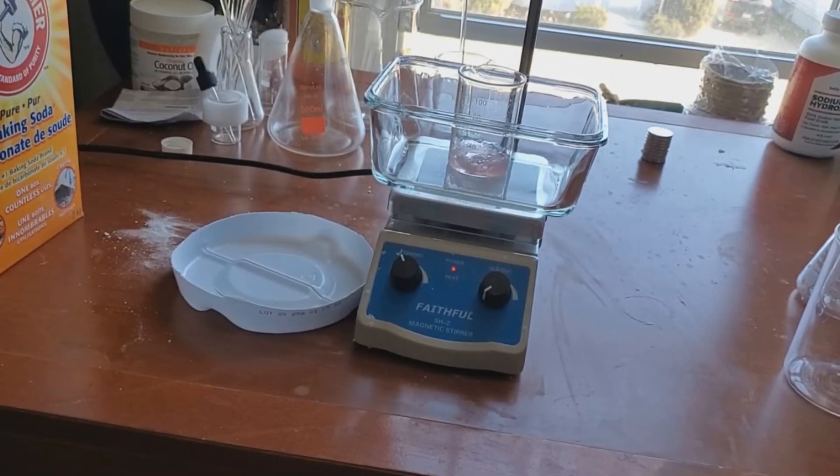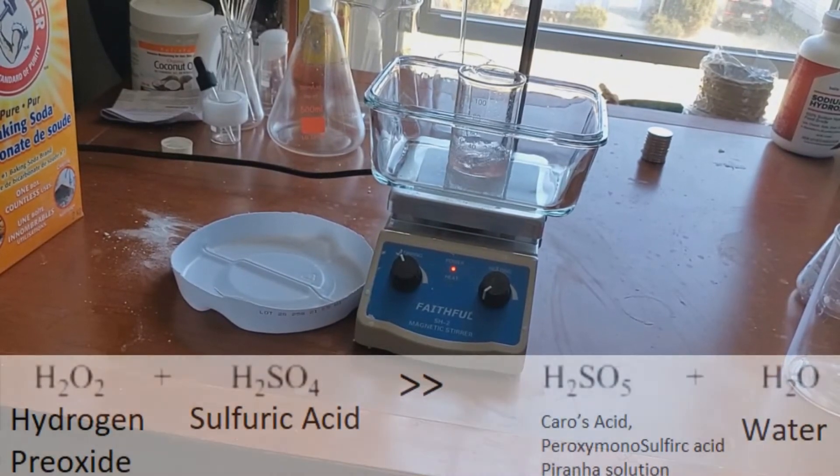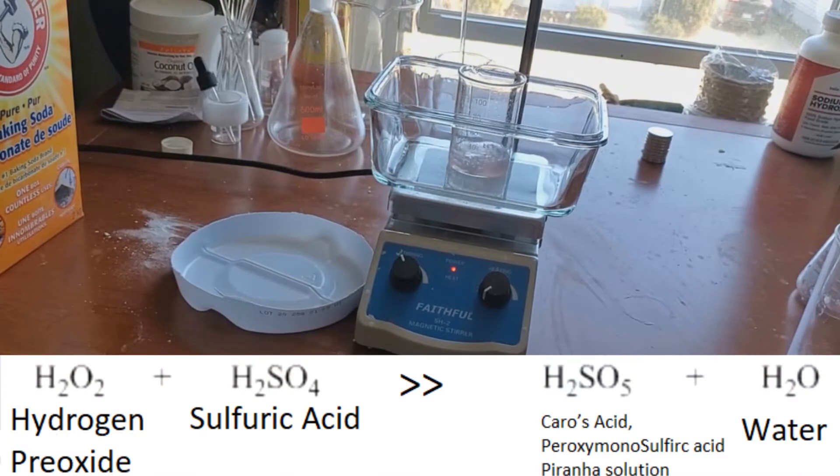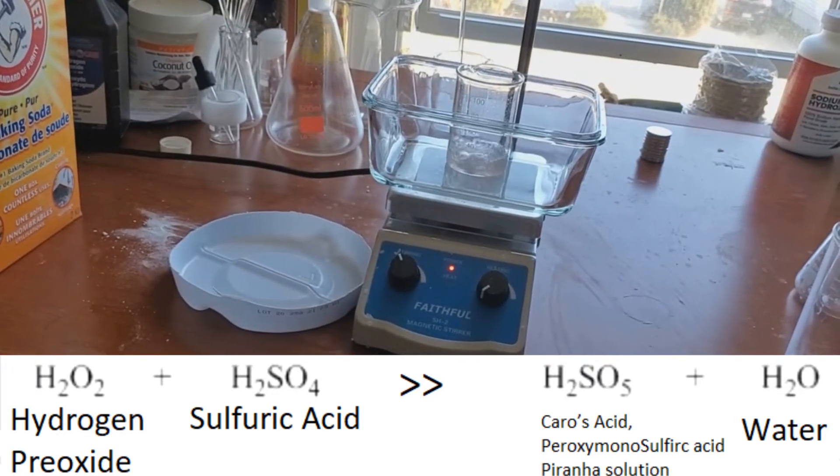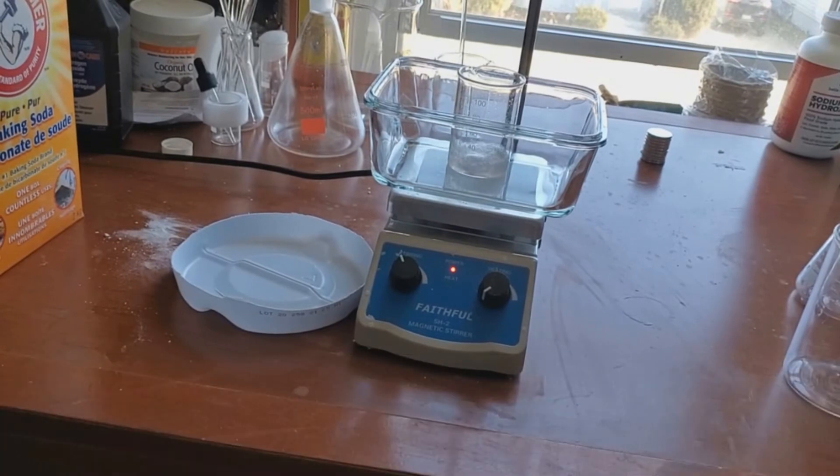So what is happening is we are making a dilute piranha solution. The sulfuric acid is reacting with the hydrogen peroxide to create something called Caro's acid and water. Caro's acid is the same as piranha solution, and the scientific name for it is peroxymono sulfuric acid. It's all the same name for the same solution.